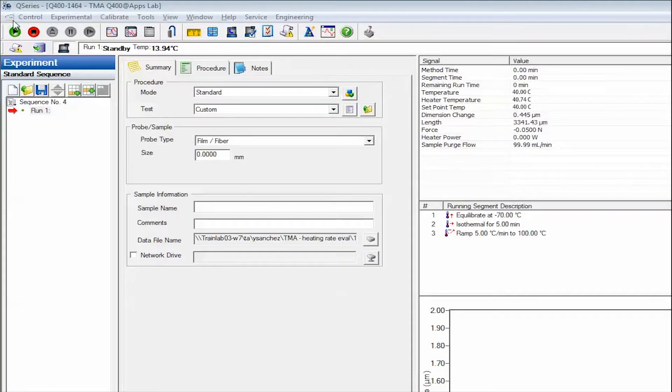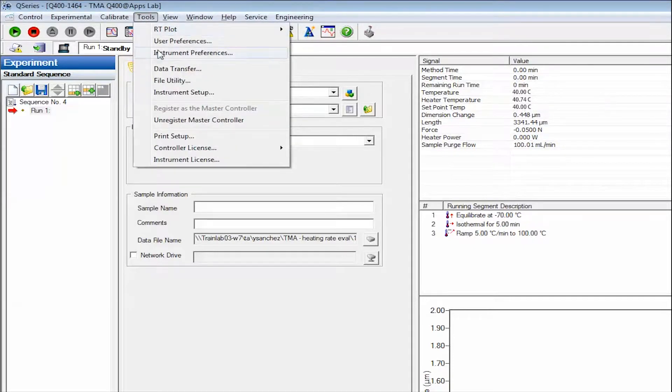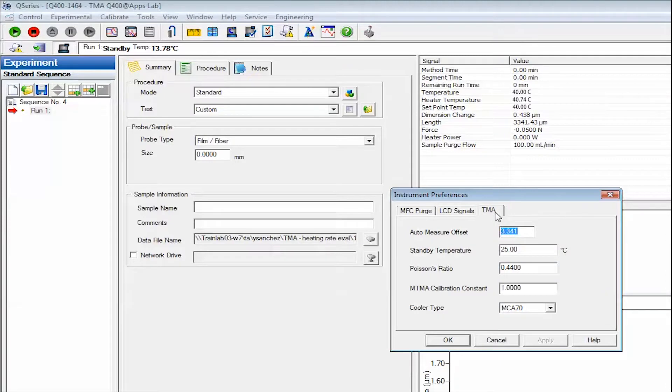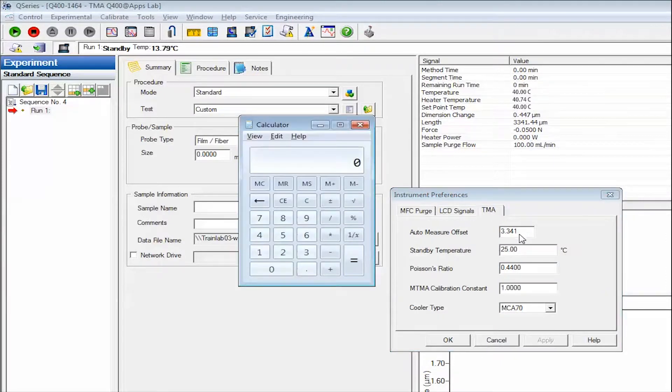Determine the Auto measure offset as follows. On the instrument control software, select Tools, Instrument Preferences, TMA, and record the value listed as AutoMeasure Offset.